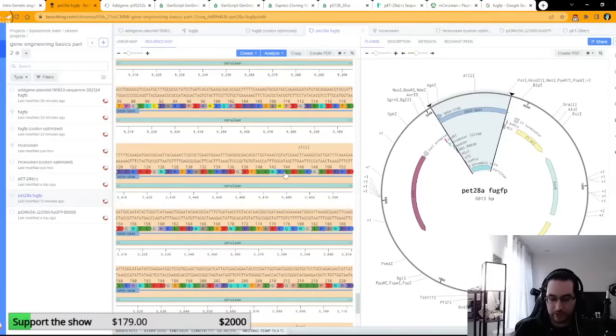Can you modify Benchling to add a proper button to export to GenScript? No, it's not my tool. It's a free tool, but it's not a tool where you can install plugins as far as I'm aware, so unfortunately that's not possible. I think the industry version of Benchling, because this is the free version, is like $10,000. It's very expensive. That might be able to do stuff like that, but I don't know.